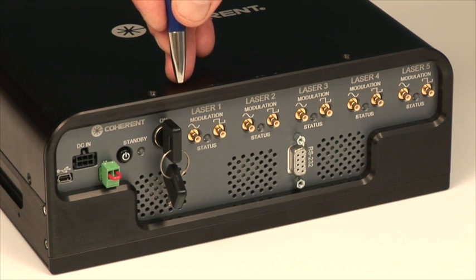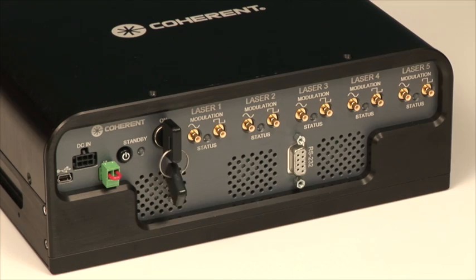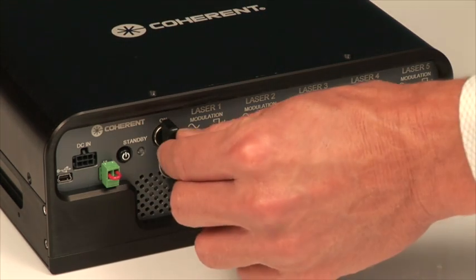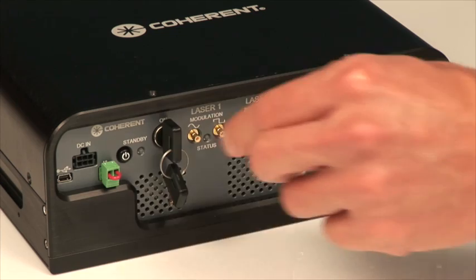The key switch is an important safety feature for laser safety. It has a standby position as well as an on position for laser emission and an indicator next to it stating its status. The key switch can be removed in the off position, but when turned on, the key switch cannot be removed.